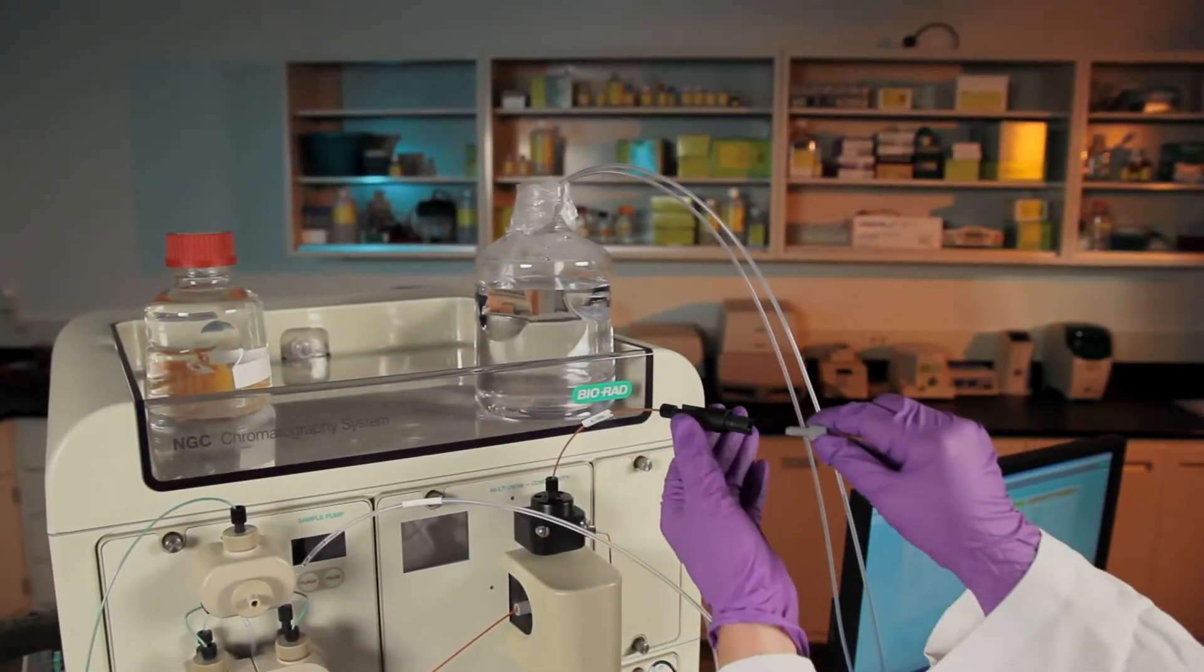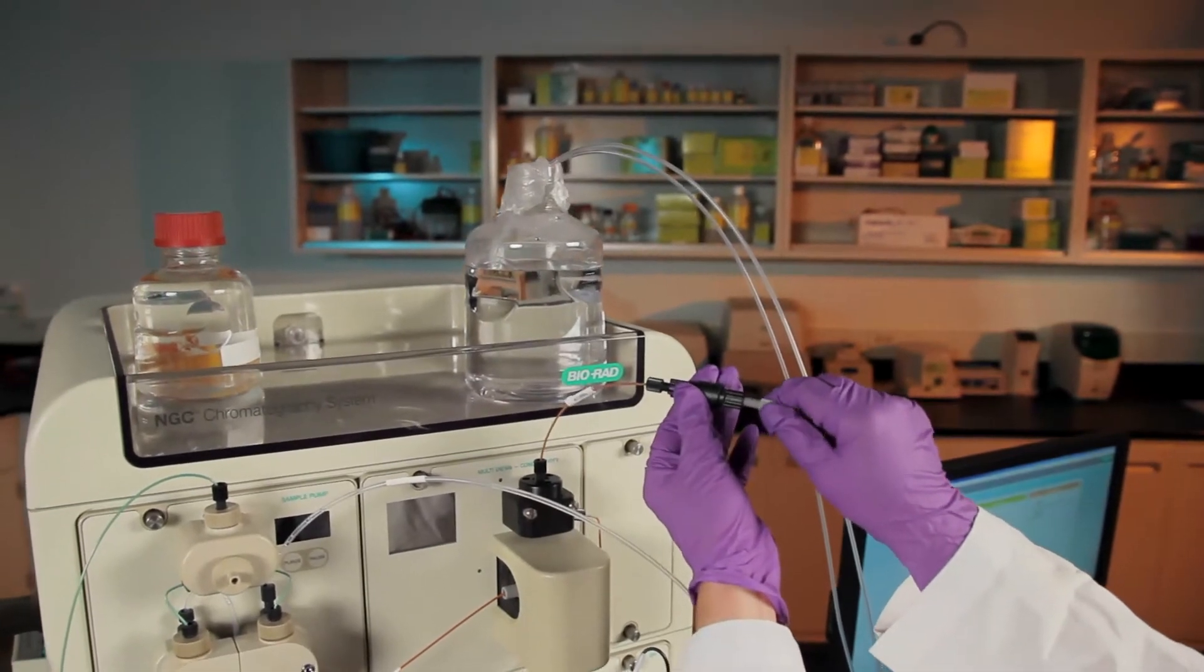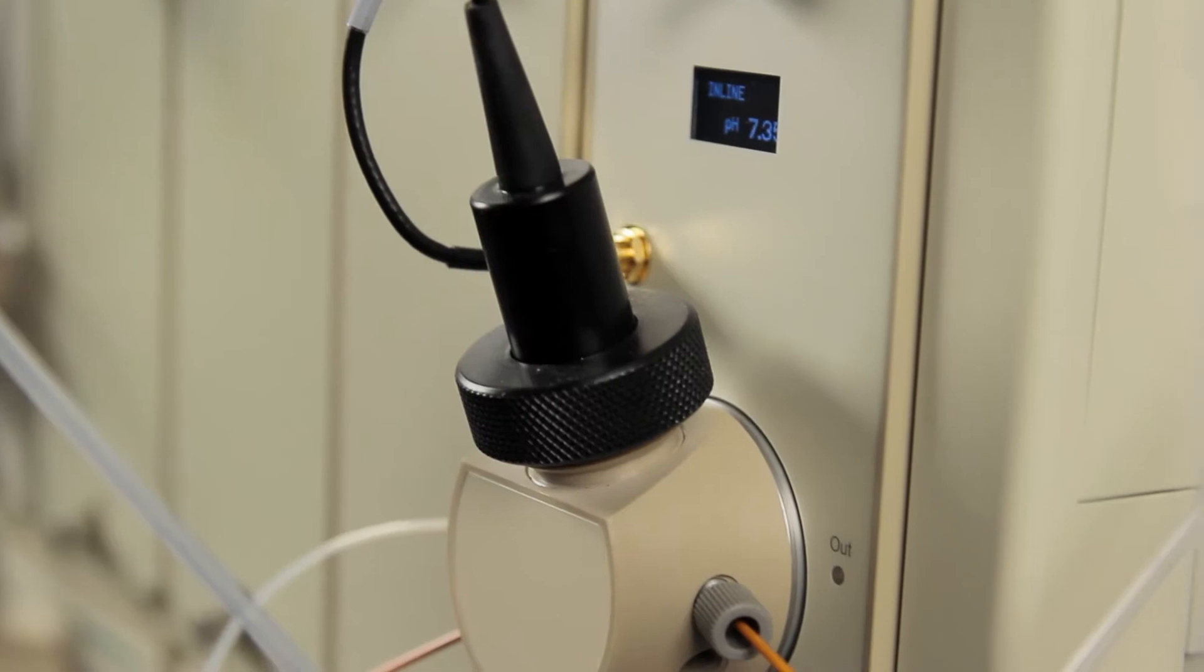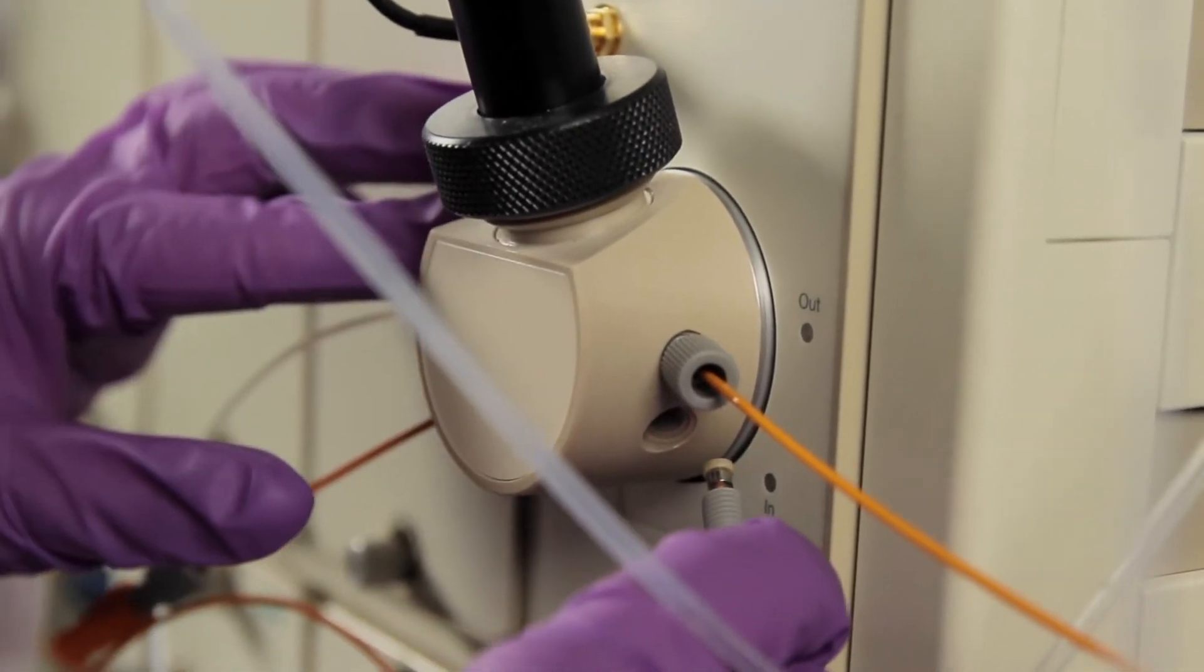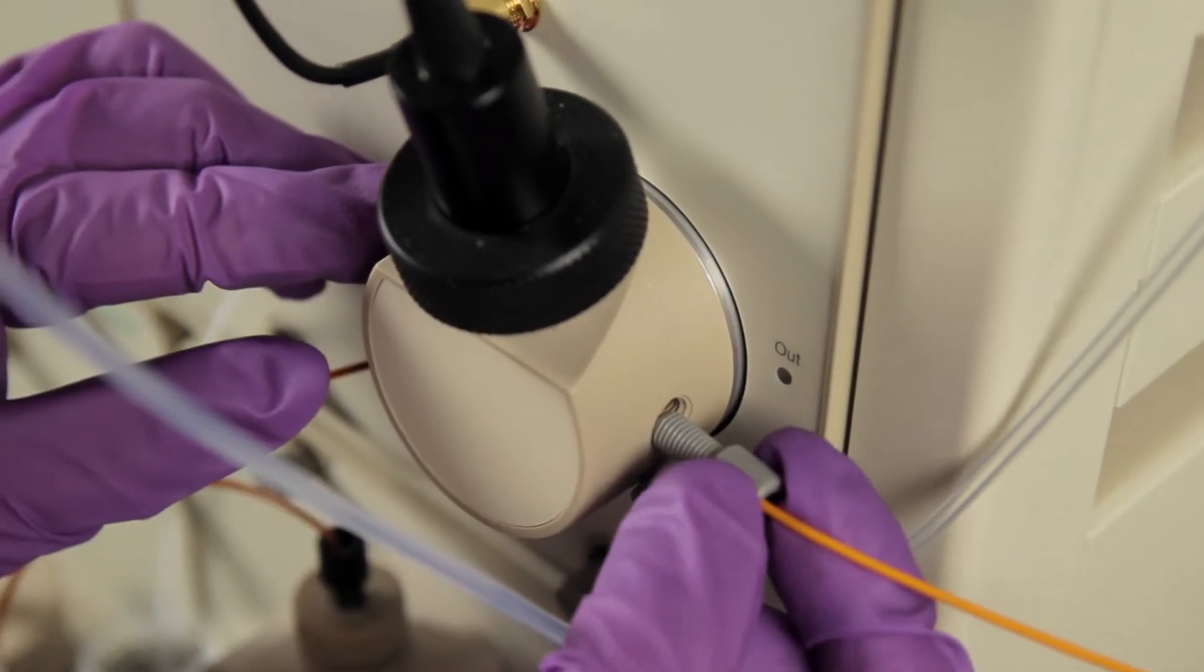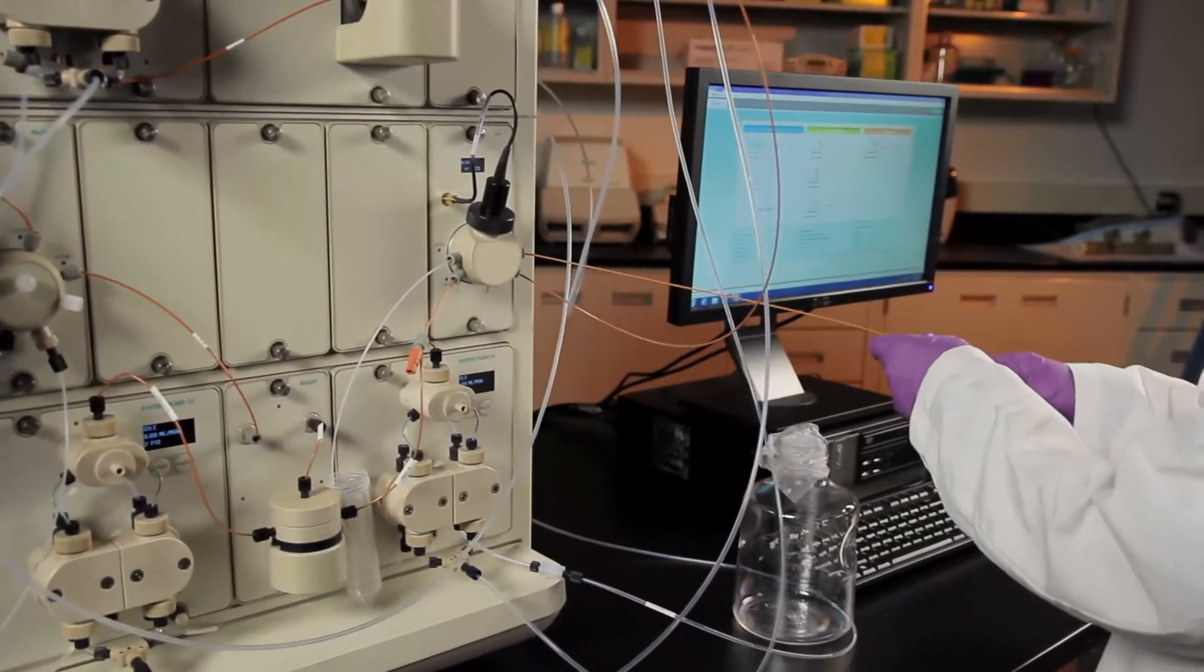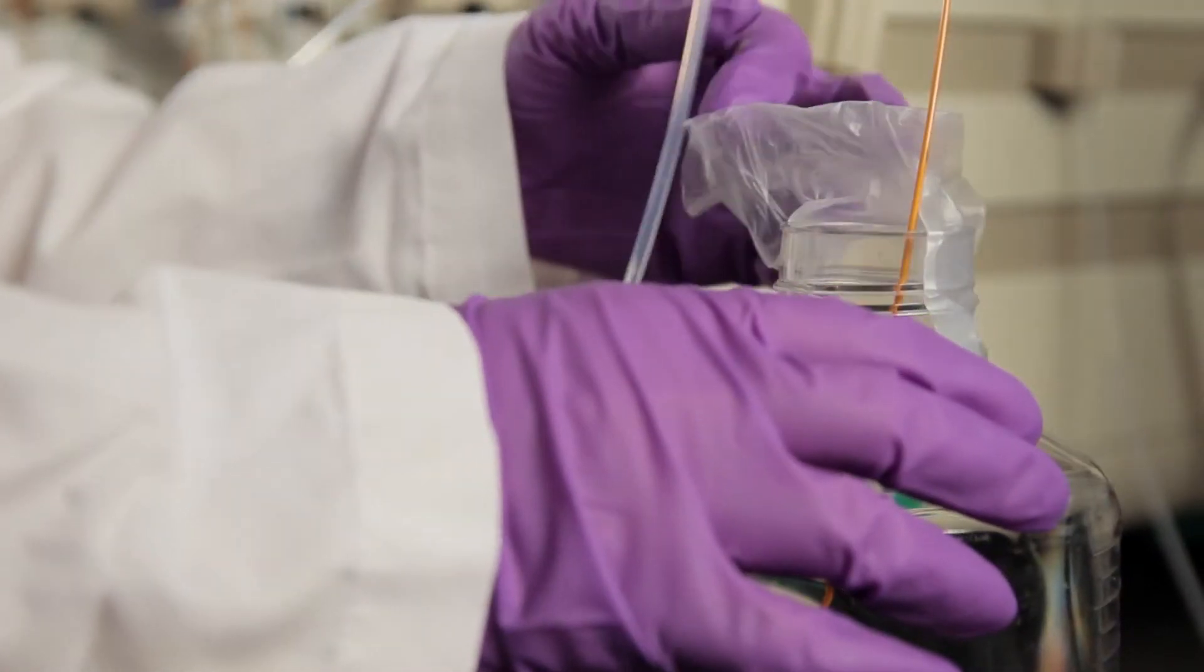To connect the pH valve, attach the outlet tubing from the back pressure regulator or conductivity monitor to the in-port on the pH valve. Then, connect tubing from the pH valve out-port to the diverter valve of the fraction collector, or to the waste reservoir if not using a fraction collector.